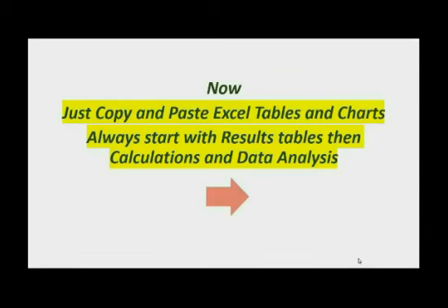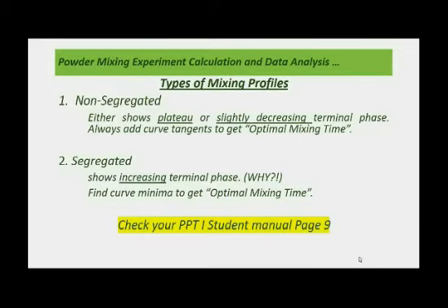Now, just copy and paste Excel tables and charts. Always start with results tables, then calculations and data analysis.